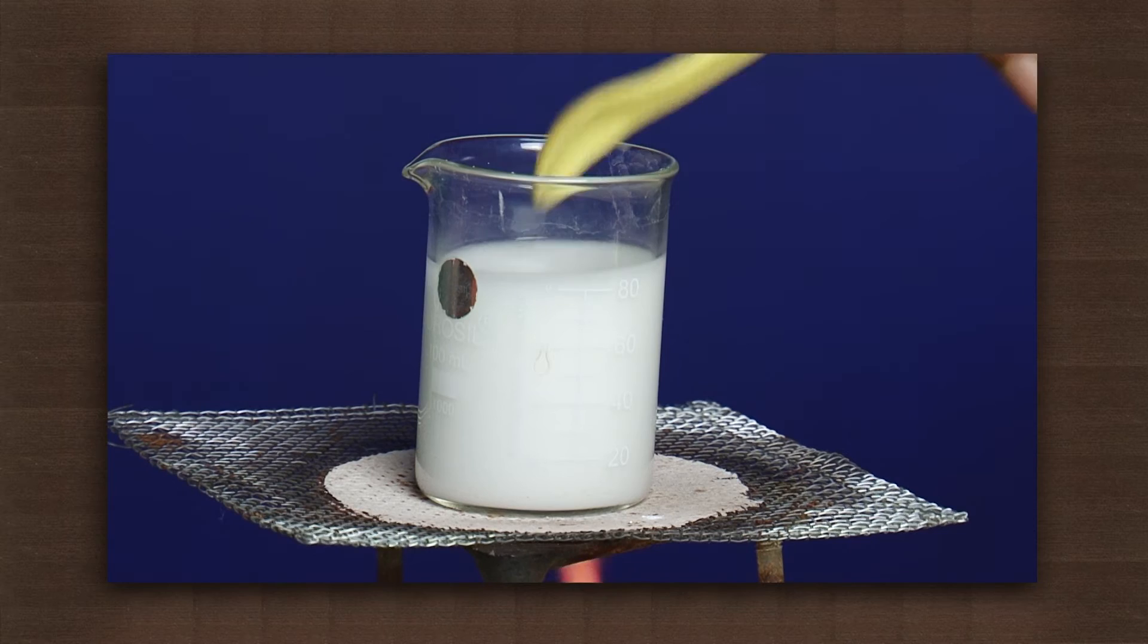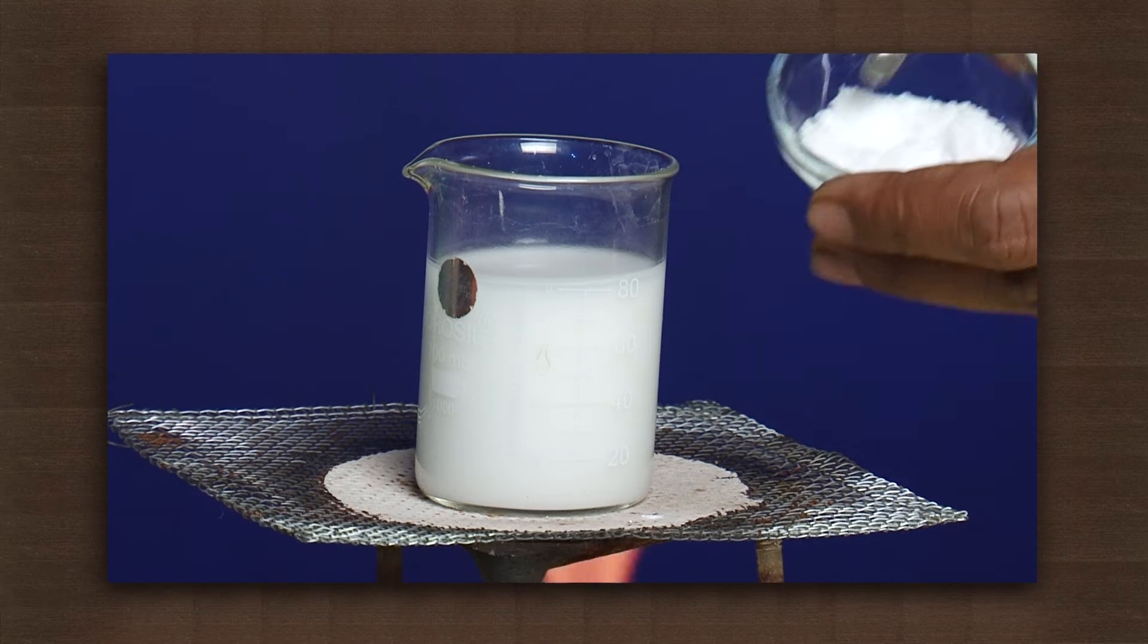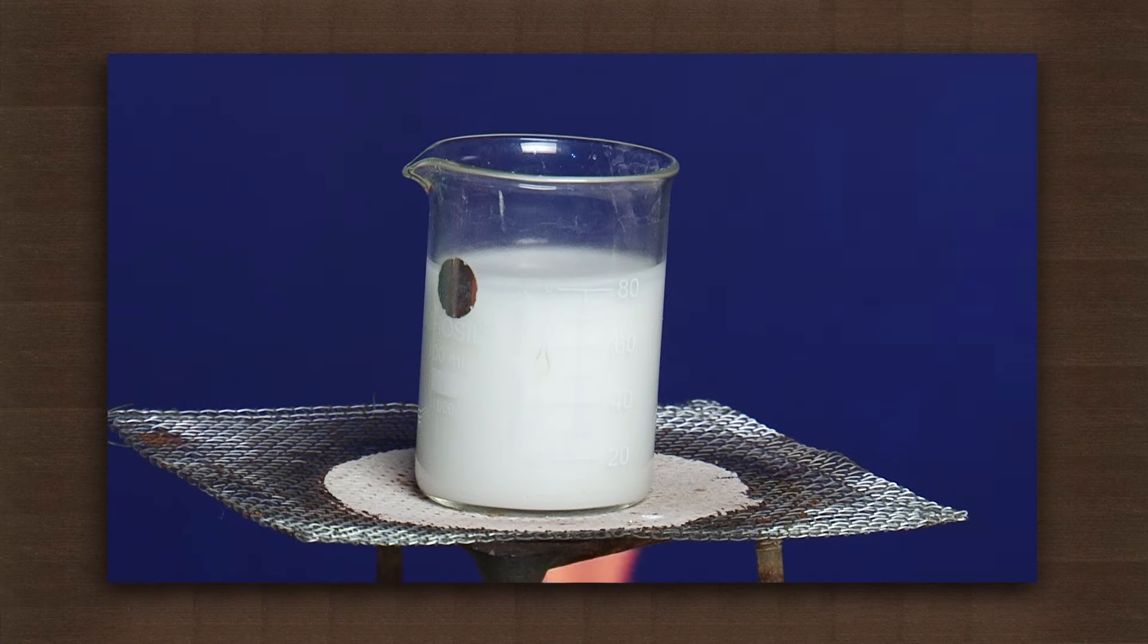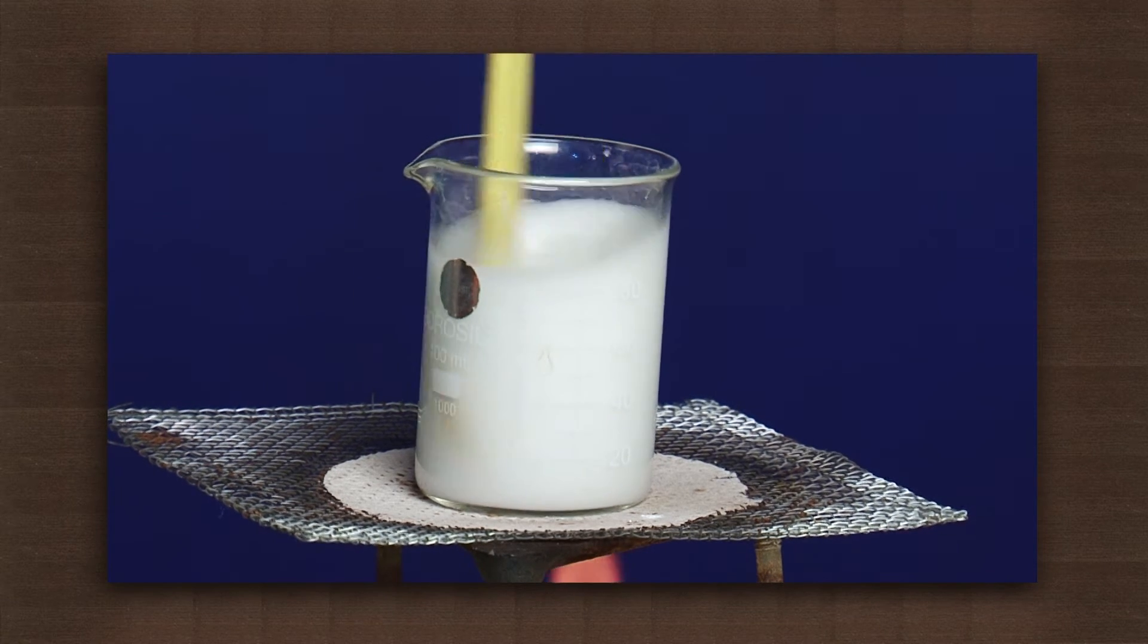Add some potassium iodide to the solution. Boil the solution.